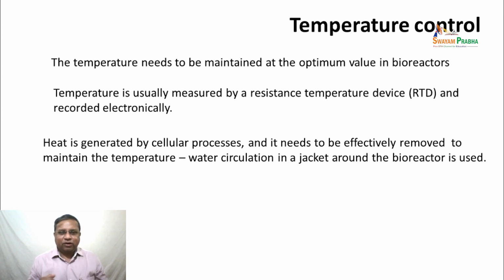It's a little difficult to have heating by an electrical element, because the heating element would reach very high temperatures, and cells that come in contact with that heating element could be dead if such a system is used to maintain temperature. It's not normally done. Usually it is done through control of the jacket water temperature.